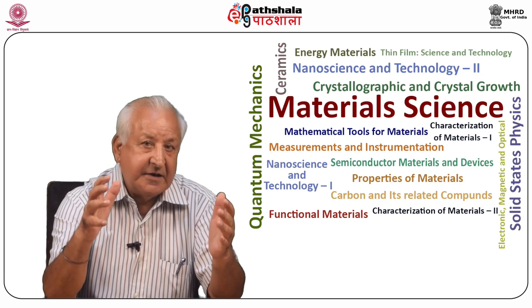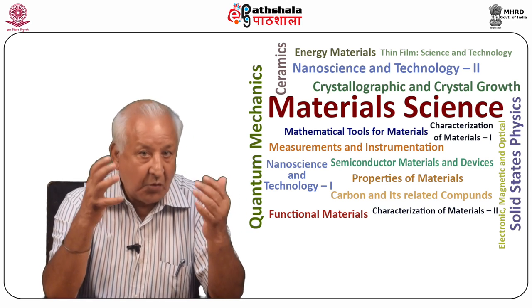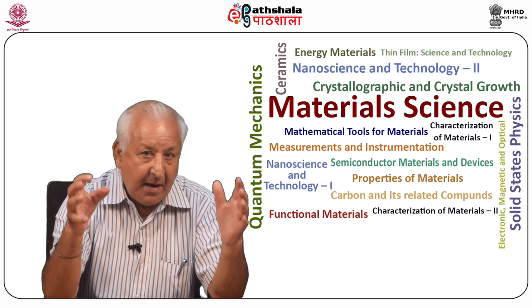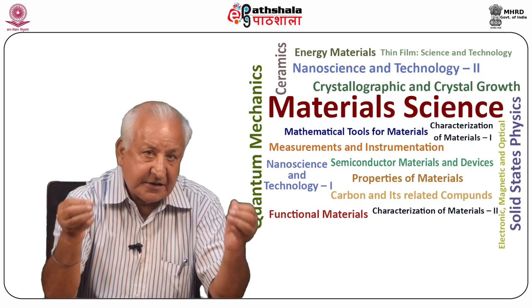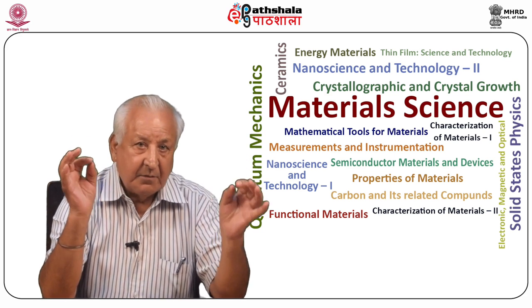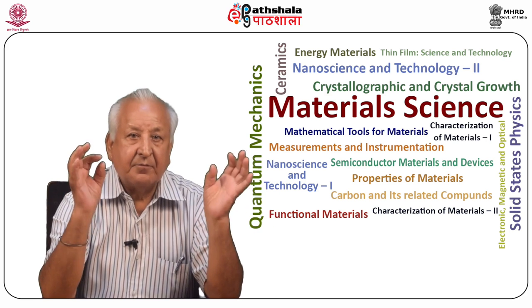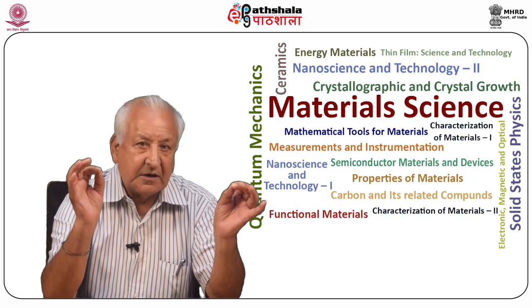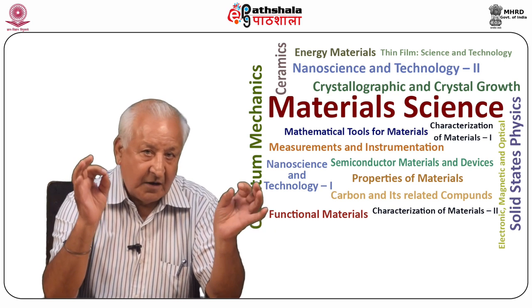1931, Berg gave an idea about a method wherein X-rays could be used as probes for the study of imperfections in crystals. Barrett further developed the method in 1945. X-ray topography requires point-to-point correlation between the X-ray intensity in the topograph and the crystalline perfection in the crystal. It means that any single spot in the crystal should be imaged as such in the topograph.